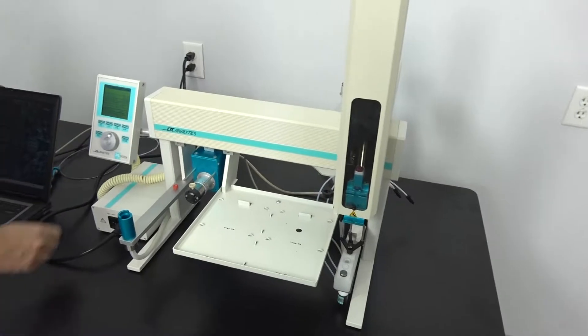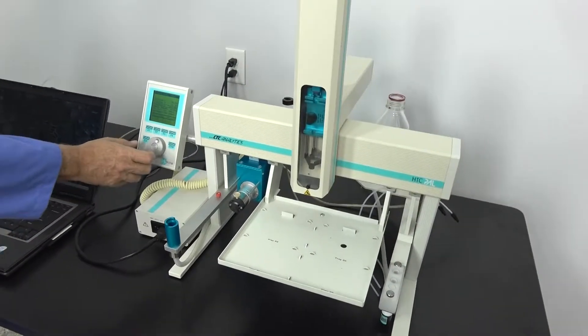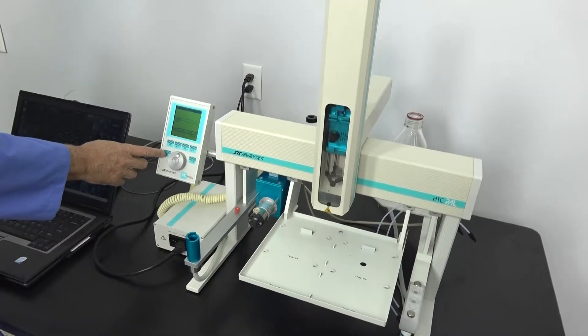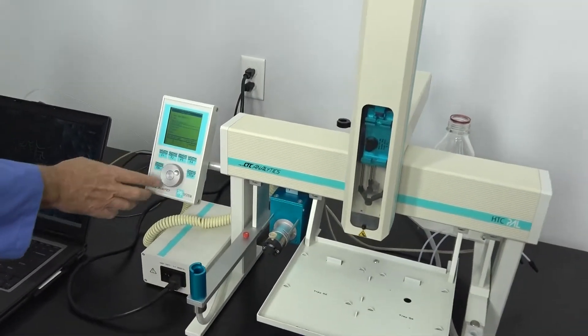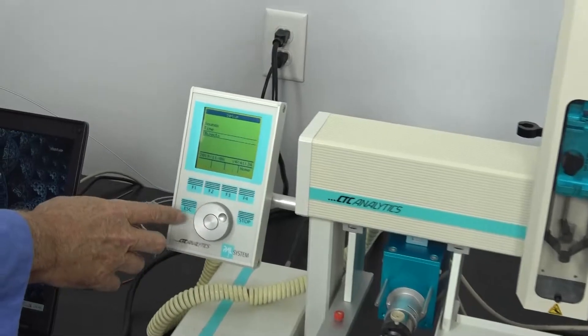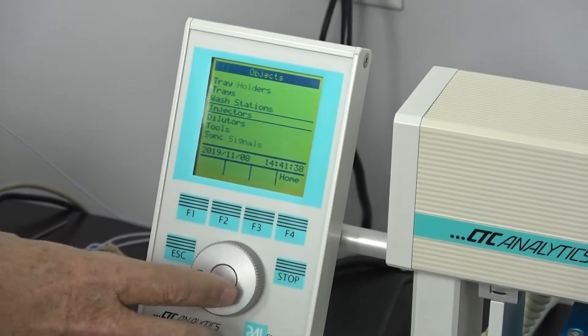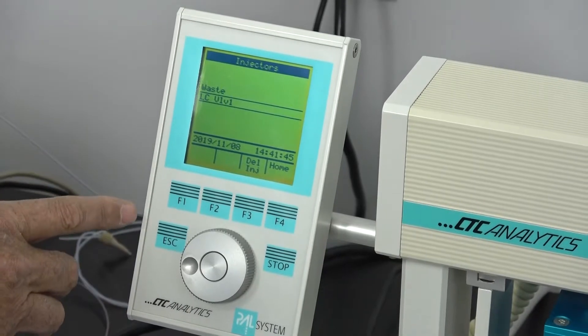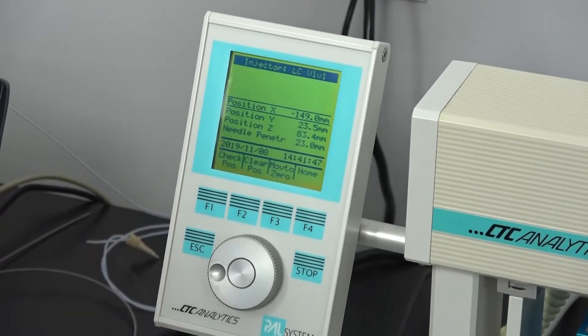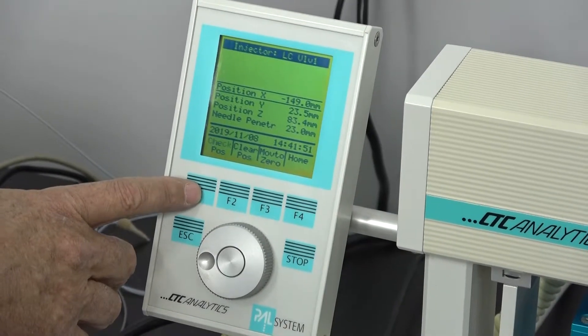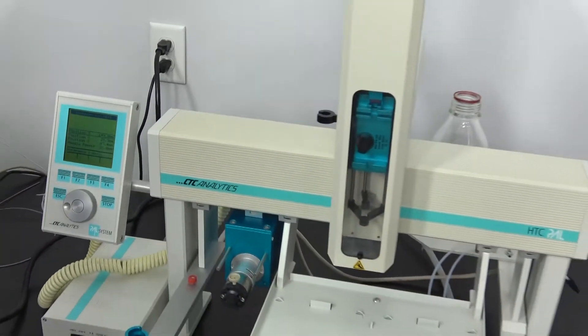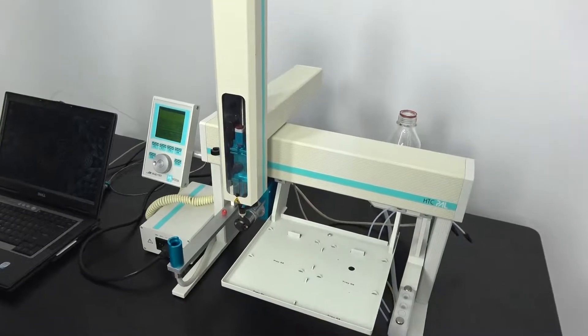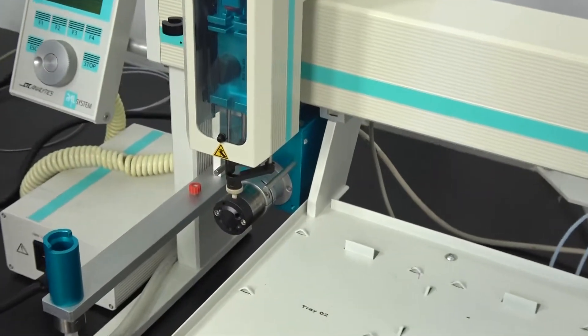Same way with the valve position. If I escape, it's going to rehome. Take me up one level into the program. One level up and I can go into my injectors. And I can set it to look at the chromatography. And again, check my position. Do the homing again. Now here is where it has to get a needle down that little hole. That one I've adjusted spot on, which it has to be to run one of those. And those you adjust in tenths of a millimeter.